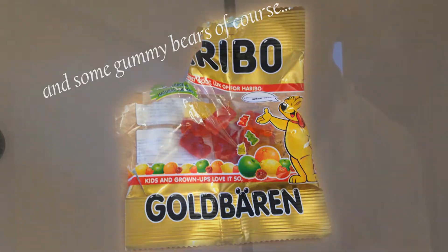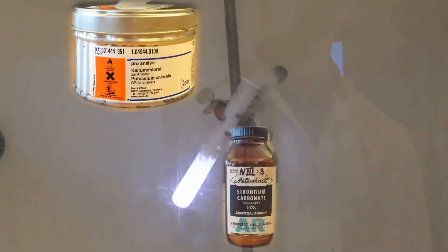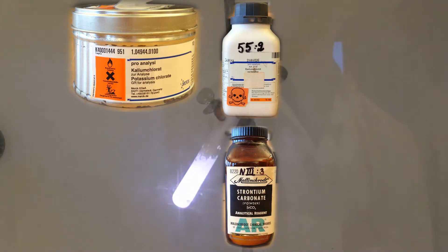To do this you need a test tube, a holder, a burner and some chemicals. The basic chemical is potassium chlorate, but if you add either strontium carbonate or barium chloride the colour of the flame changes.